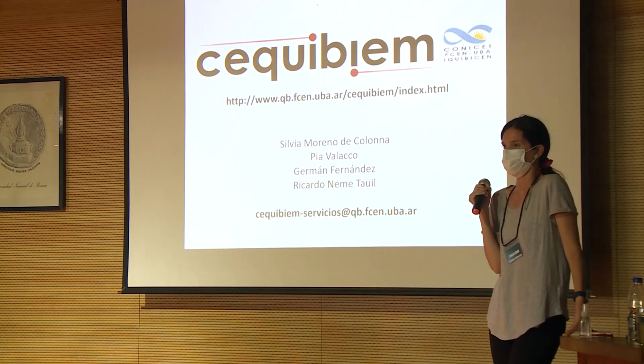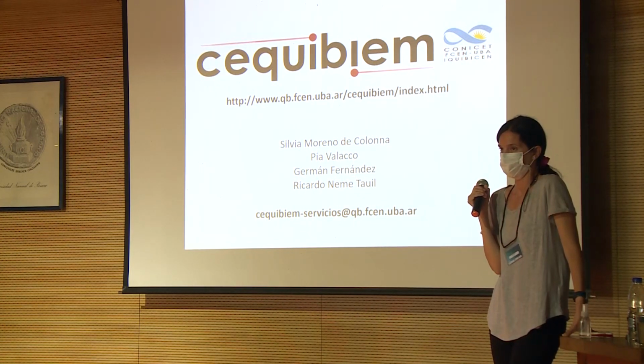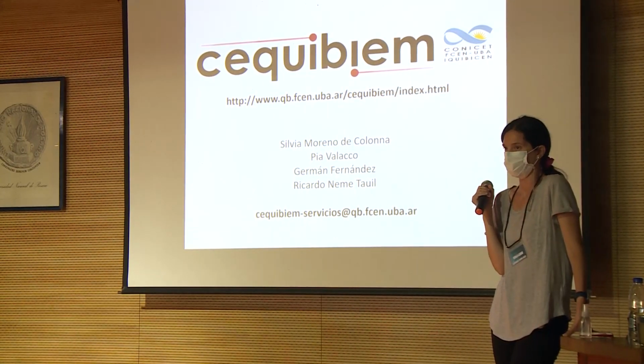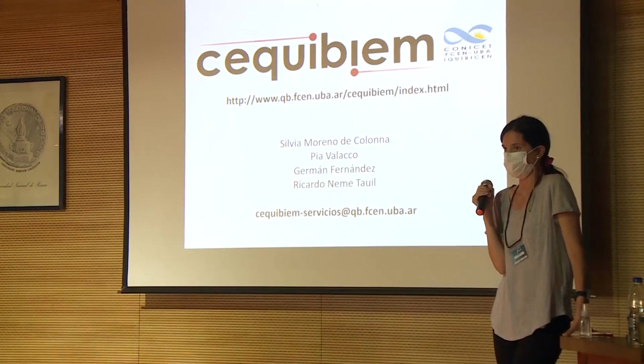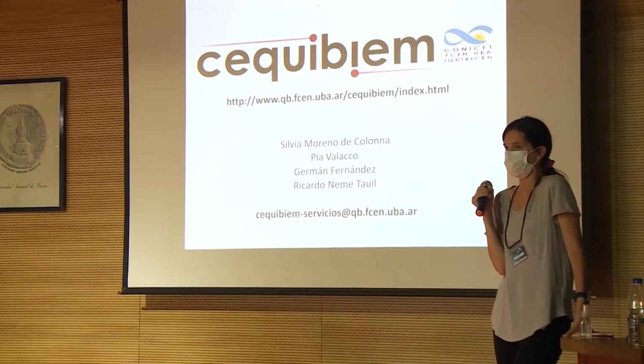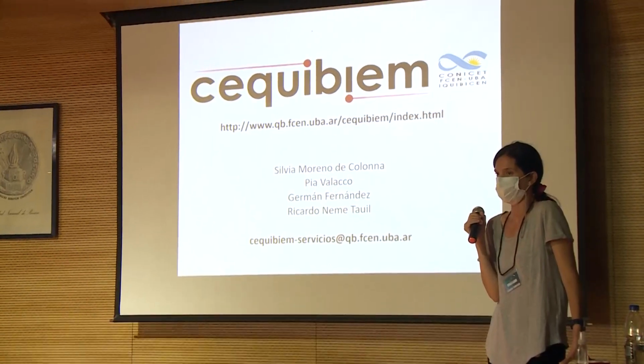For example, a TOF has a dynamic range up to 40,000 Dalton, and the quadrupole 4,000 Dalton. You may lose information; you can only analyze a signal or peptide up to 4,000 Dalton.